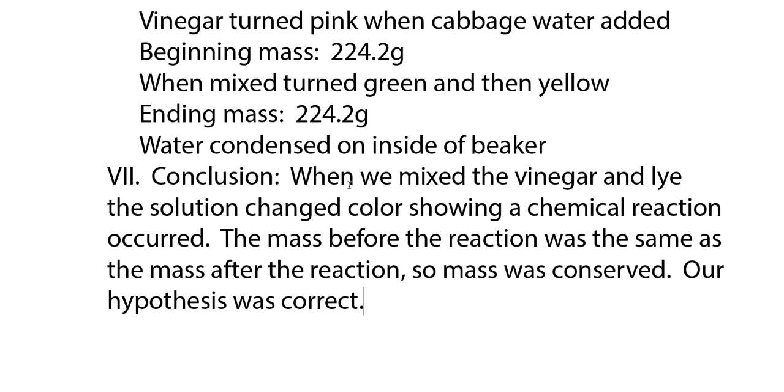We analyze any of our data. Our analysis was 224.2 equals 224.2. So the mass before the reaction was the same as the mass after the reaction, so it was conserved. And then we say whether our hypothesis was correct or not. Only other things we could add in here is any real-life applications, or if our hypothesis was incorrect, we could address possible reasons for that and maybe address how we changed the experiment to see if we could change the results.